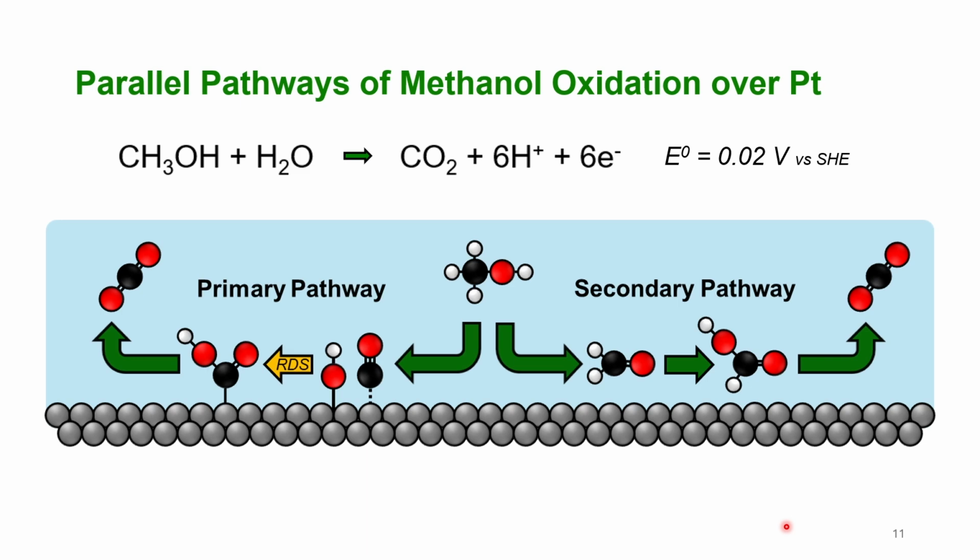The first thing is that this is an isotopically labeled experiment, therefore our reactant could not exhibit a kinetic isotope effect. We also wanted relatively minimal signal overlap, because this is a validation reaction, and we wanted to make sure the product of interest we were analyzing didn't have too much deconvolution to deal with.